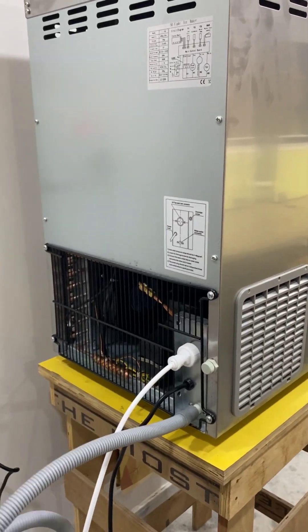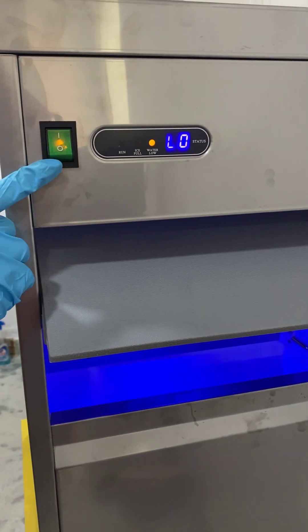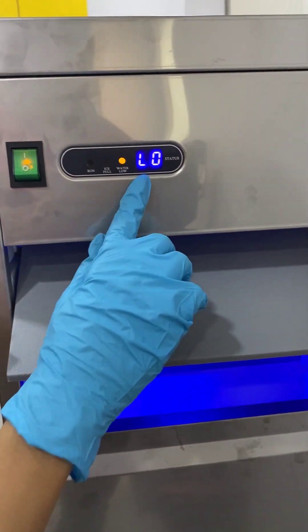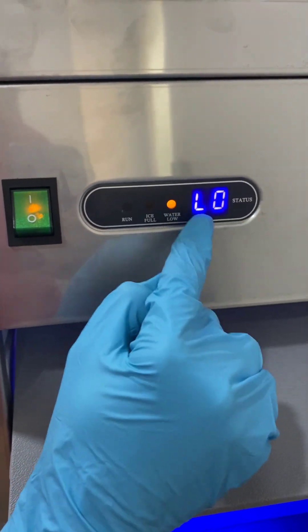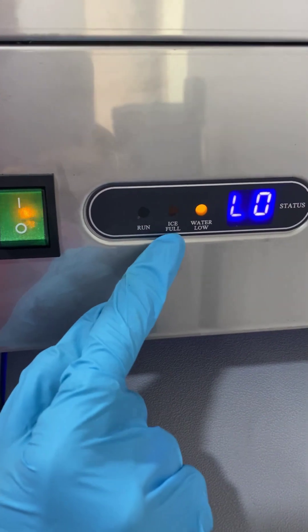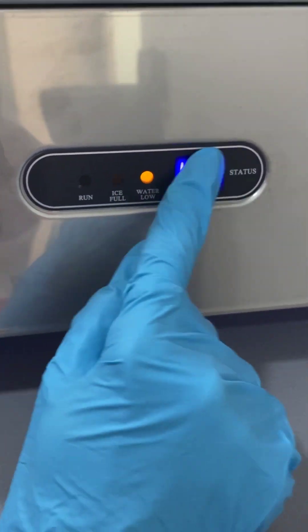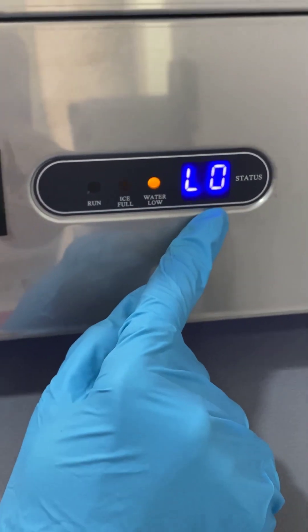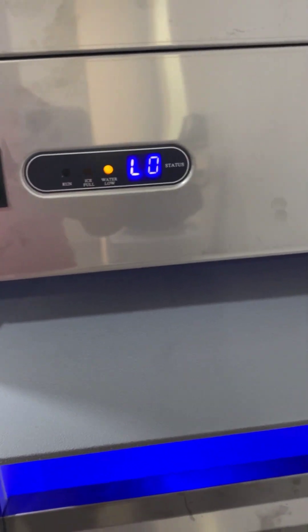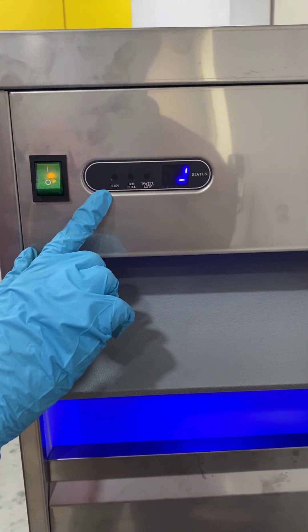By pressing this key you can turn on the machine. In this display you can see different functions: the running light blinks here, the ice full light blinks here, and the water flow light blinks here. All the status is shown in this display. As you can see, the machine is now in running position and has started forming ice flakes.